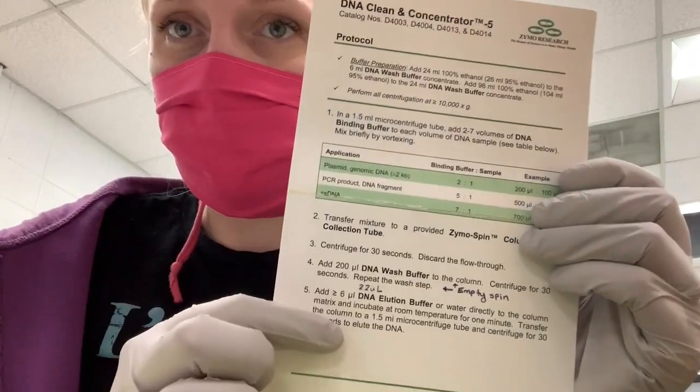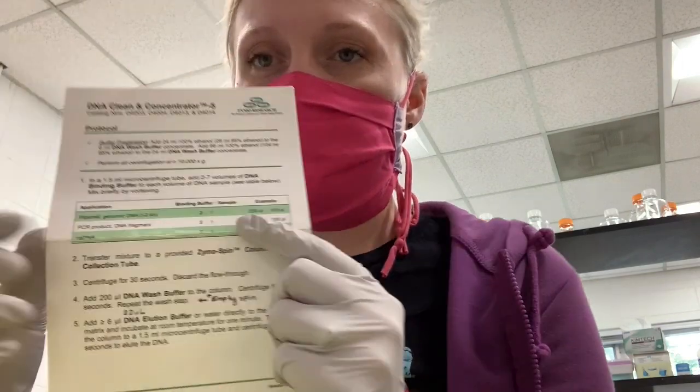So again, this kit has a protocol in it, so I'm just going to follow this protocol. This says in a 1.5 ml tube, add 2 to 7 volumes of binding buffer and then transfer into the column. That's the second step. I sort of combine these and just transfer the PCR directly without going into another tube. So I'll show you how I do that.